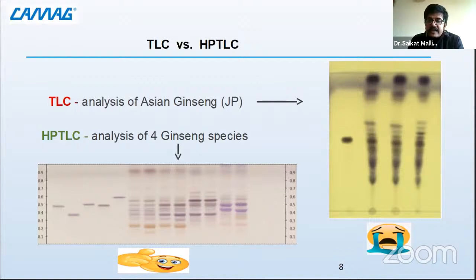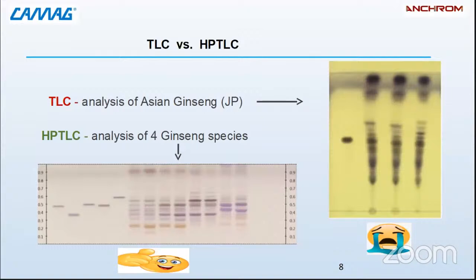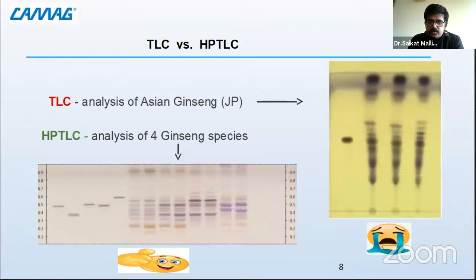And that is exactly where, if I had a tool which is so rapid, and incidentally, I had access to it, the screening became very easy. With such a large number of samples, if I go to some other chromatographic technique, I'll have to take care not to damage the chromatographic system. There is high pressure liquid and everything involved. You have to wait for the detector to stabilize, and so many practical problems. Whereas in this technique, it's ready to go. You just have the samples. You just take a plate, which is your stationary phase. Right now, what you can see is a stationary phase on which the sample is immobilized. It gets separated, and after that, what you see is the separation like this. So it really gives you ultimate power when you're talking about the research aspect.